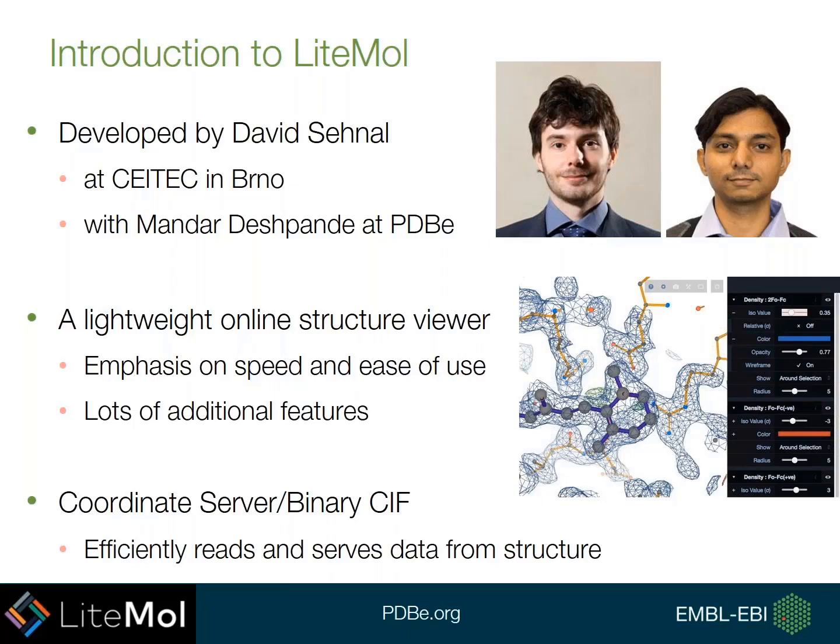And what it is, it's a browser-based online structure viewer. It's very lightweight, and the emphasis is really on the speed of use. However, because of the links to us at PDBe, there are also a lot of additional features that we've been able to incorporate into the viewer.